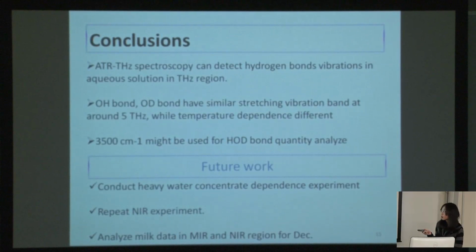This is my future work. First, I will conduct the heavy water concentration dependence experiment again in order to make sure whether this band can be used for quantitative analysis or not. The second one is I'd like to repeat the near-infrared experiment. Today I didn't show any result of the near-infrared experiment because I conducted it twice. The first time I used air as reference, but the result is very strange. All the values of absorbance are negative.